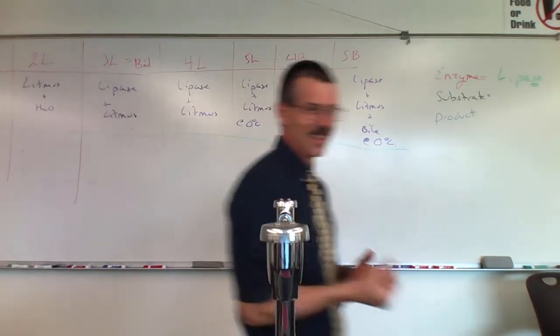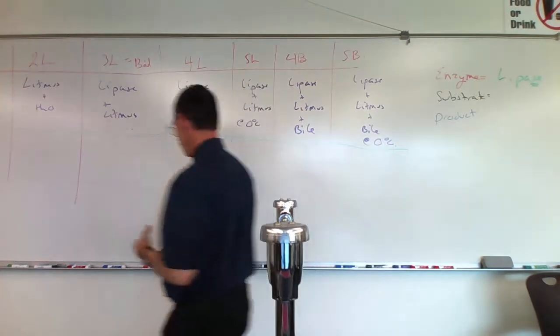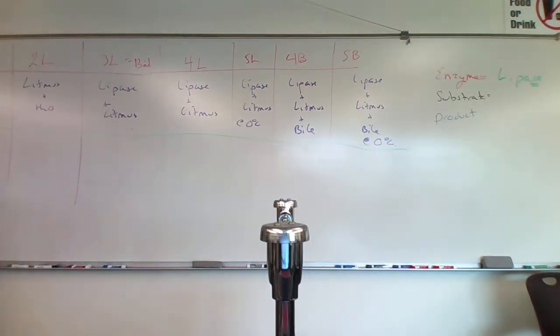So here we go. The 1L is clear. 2L is... no change.